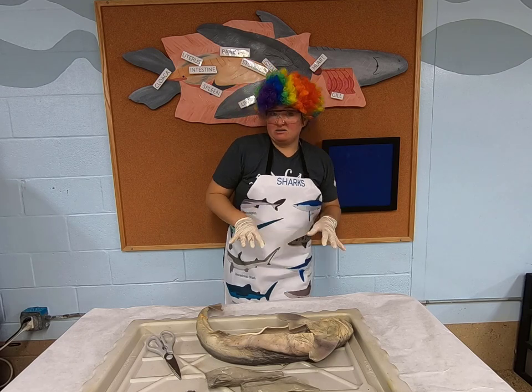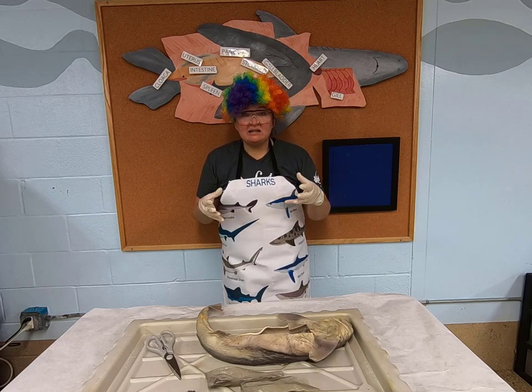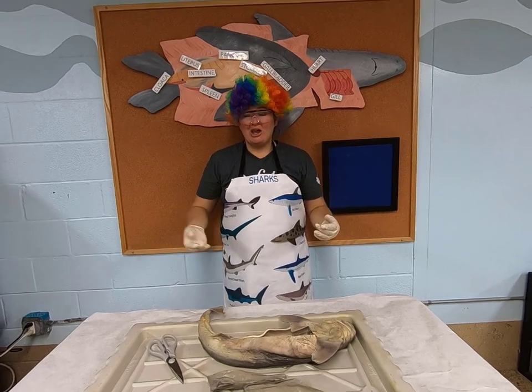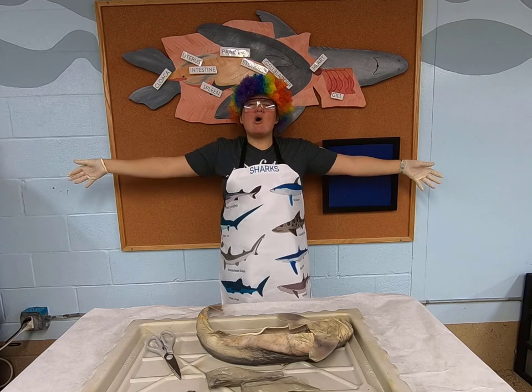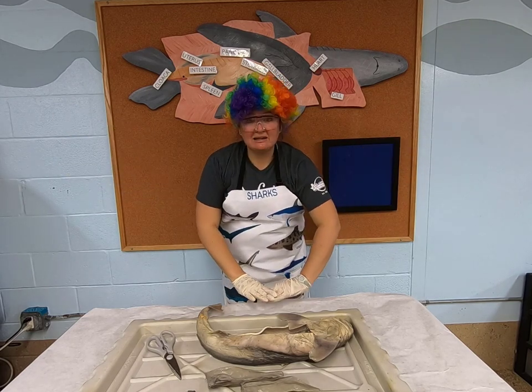Sharks don't have lungs, so they can't do that. What they have instead is this oily liver that allows them to have what we call neutral buoyancy. When you're floating on top of the water, you're positively buoyant. When you're sinking at the bottom, you're negatively buoyant.